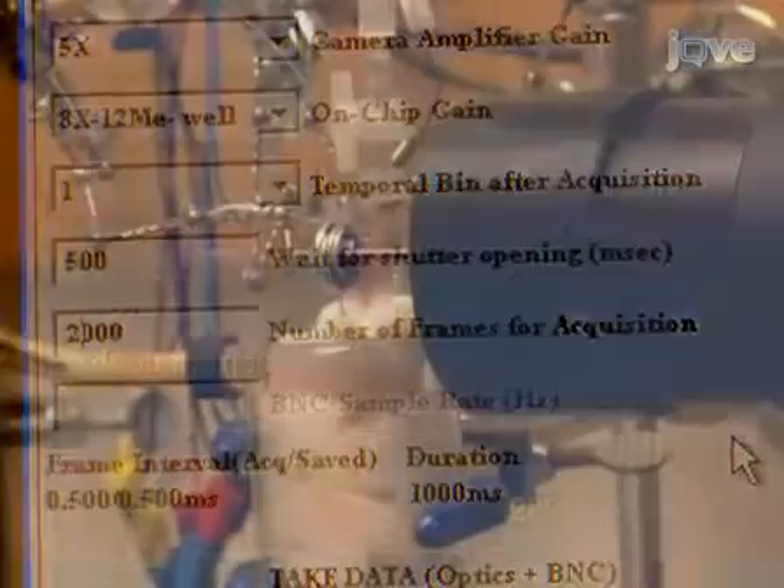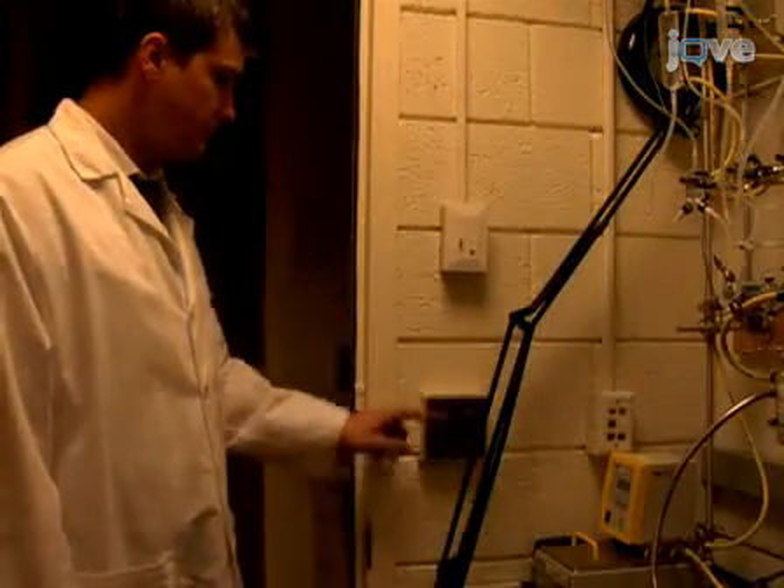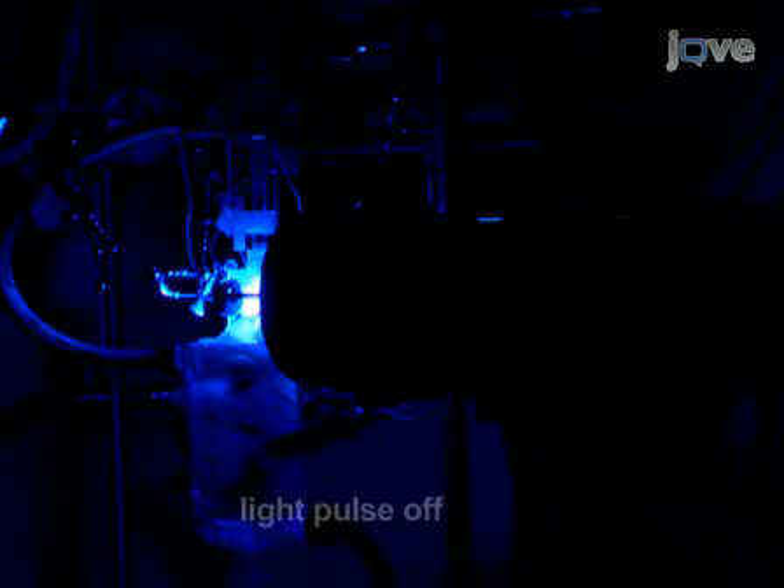Turn off or shield all room and equipment lights to eliminate background noise during the recording. The LED light illuminates the heart only during the optical recording to reduce photobleaching and dye toxicity. Control the light source shutter with a 5-volt pulse delivered through the control panel by way of a D-to-A board in the computer.